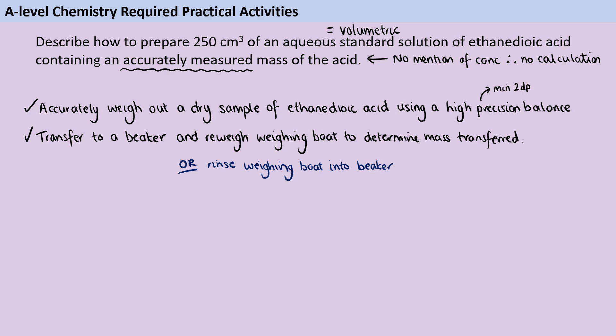So we've now got our sample in a beaker and we need to start dissolving it. So we're going to dissolve it in a very small volume because we don't want to risk having a greater volume than will fit in our volumetric flask. And it's going to be dissolved in distilled water because, of course, this is an aqueous standard solution. So it needs to be in water and we're going to use a glass stirring rod to help it to dissolve.